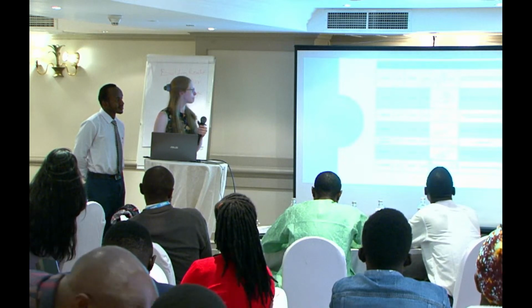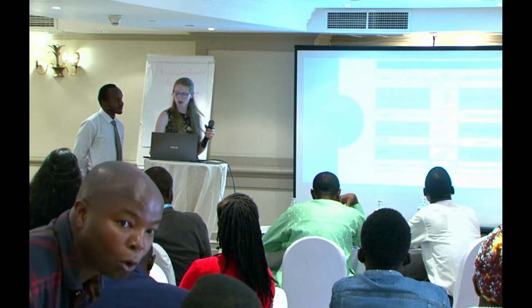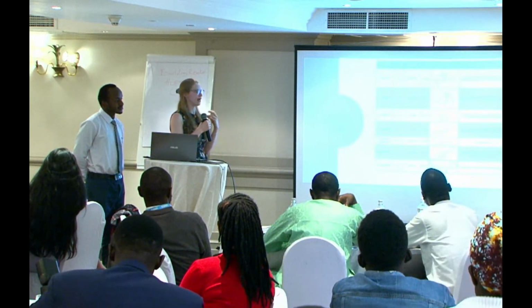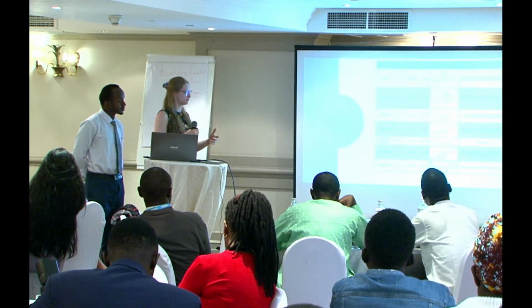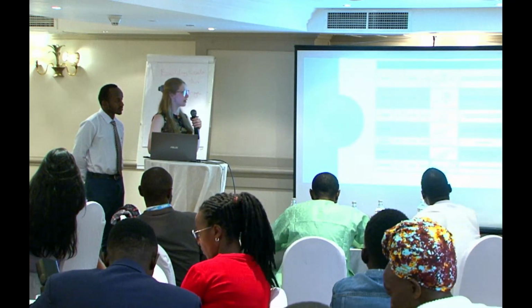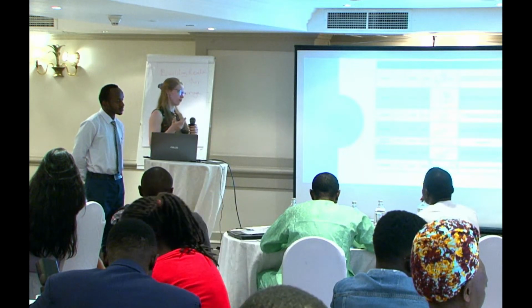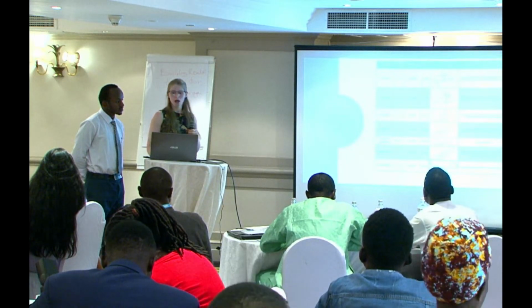Okay, that was really cool. So, assume I give you half a year. What would you do differently for this particular project? Oh, okay. I got you. So, first of all, I would make sure that we had standards to run on our GC and LC machines, so that I knew for a fact that what we're reporting as m-xylene is m-xylene, and that's how it appears on that GC machine. Second of all, I would do a lot more replicates. 3 is kind of standard. I'd like to do more because it adds rigor.